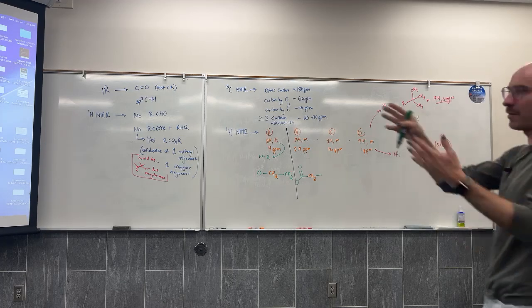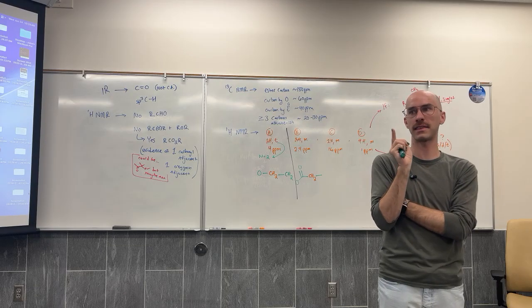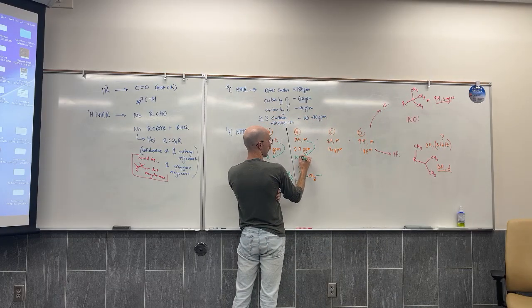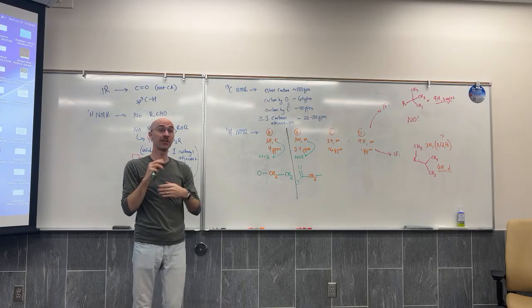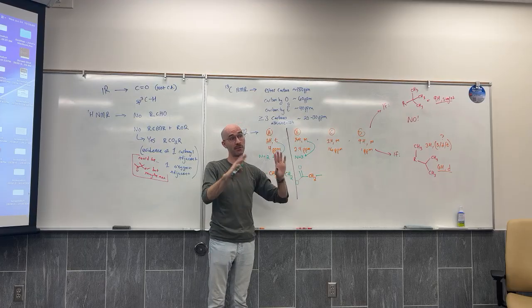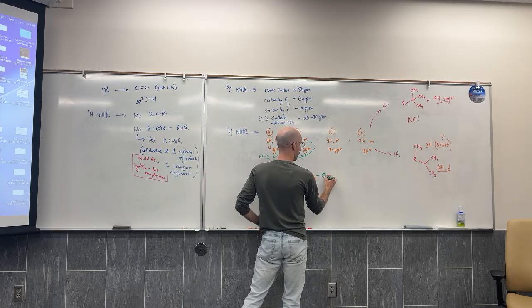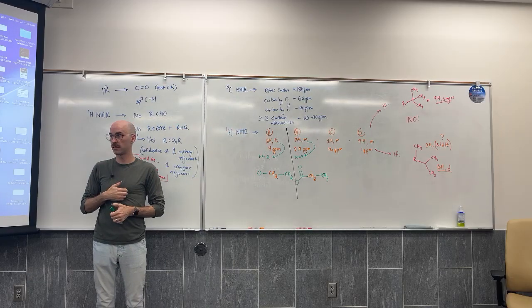So coming back to it again, I do feel like it's a quartet. And if it's a quartet, that actually makes me think it's got how many neighbors? At least 3. It can't have more than 3. It could have one neighbor, it could have a CH, a CH2, or a CH3 neighbor, but that is as many neighbors as it can have, with the other side being a carbonyl. So shall we say it's a CH3? Because that makes the most sense.